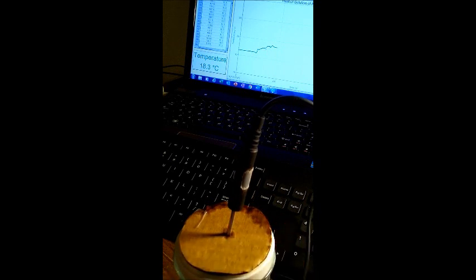And the temperature appears to be leveling off. Let's just see what it does here. I think it's all dissolved, so I will just let it sit here and see what happens to the data. Maybe when I run the next trial with KCl, it will be a little bit more of a steady increase.